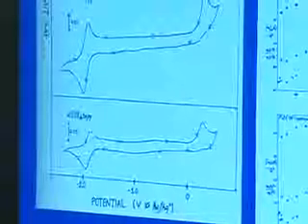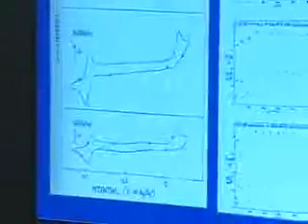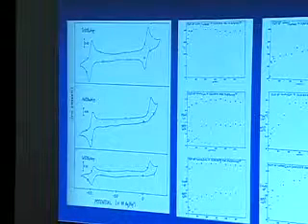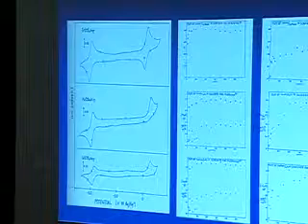Okay, well, if one does a scan rate dependence, then it turns out these peaks are reversible, and you notice they all fall, independent of the metal, at the same potential. The half-wave potentials are the same, and so we associate that with a reduction of an electron into the bipyridine. Right?